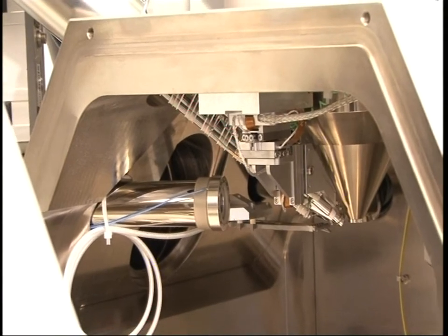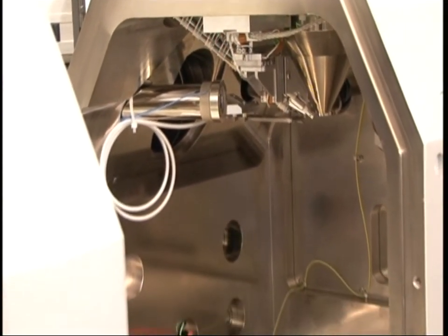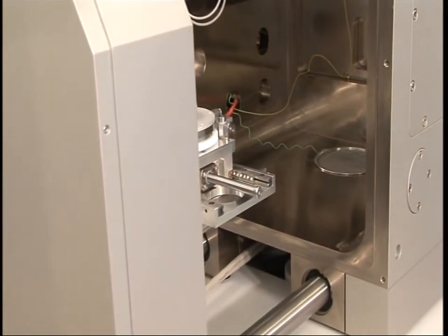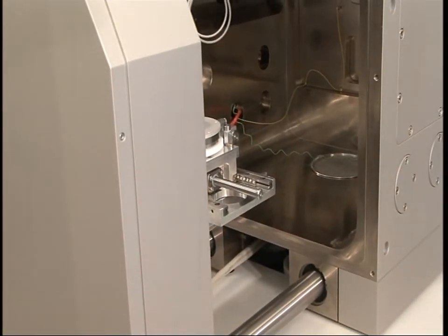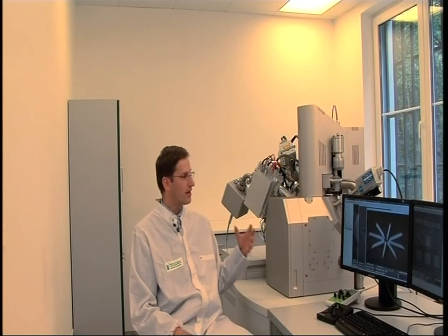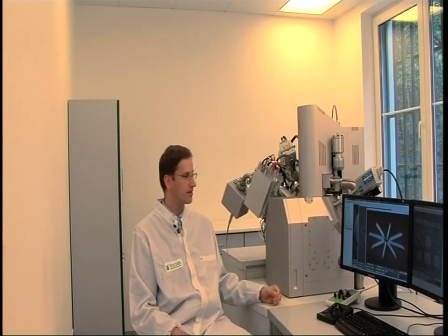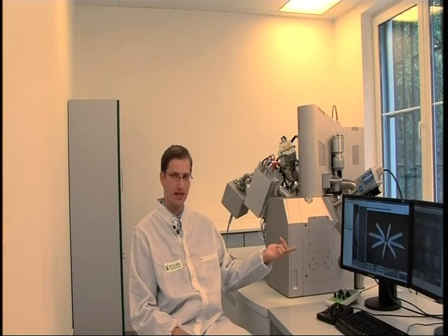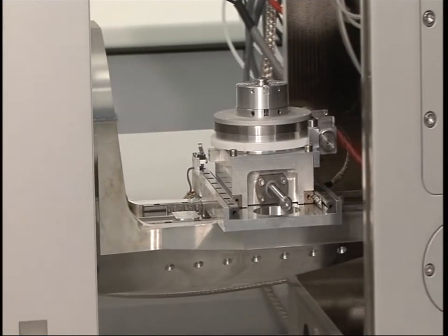This apparatus is unique in that it combines various technologies which were only available in separate devices. That means a researcher in nanotechnology typically had to do each activity separately using a special apparatus: prepare the sample, look at it to see what the results look like, modify it, manipulate it, and analyze it.